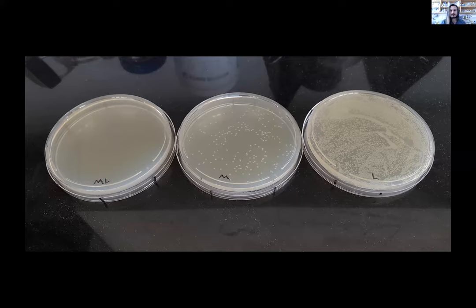The next step would be to actually incorporate whole cells, like put E. coli in a tube, blast it with red light, add methylene blue, and you can essentially do not necessarily directed evolution, but just like a really strong mutagenic pressure without risking you getting cancer. This was actually the carcinogenicity of methylene blue, or the free radicals, was actually discovered in endoscopy.